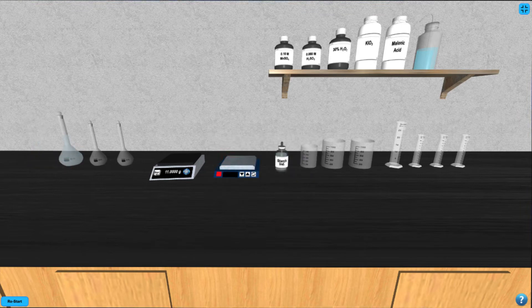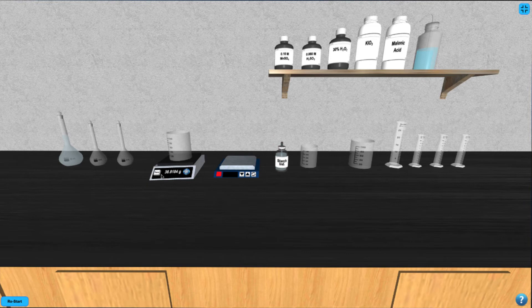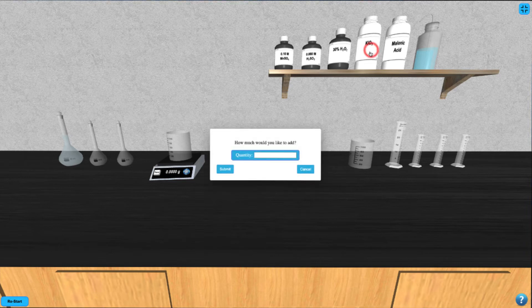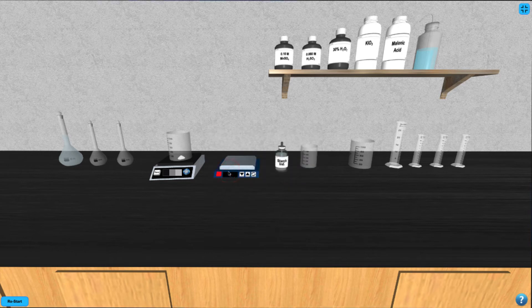To prepare solution B, click on the first 100 milliliter beaker and move it to the balance, then tare the balance by pressing the button on the left-hand side. Next, click the potassium iodate bottle and enter the mass of potassium iodate you wish to add into the beaker in units of grams. Be sure to record the actual mass of potassium iodate from the balance.